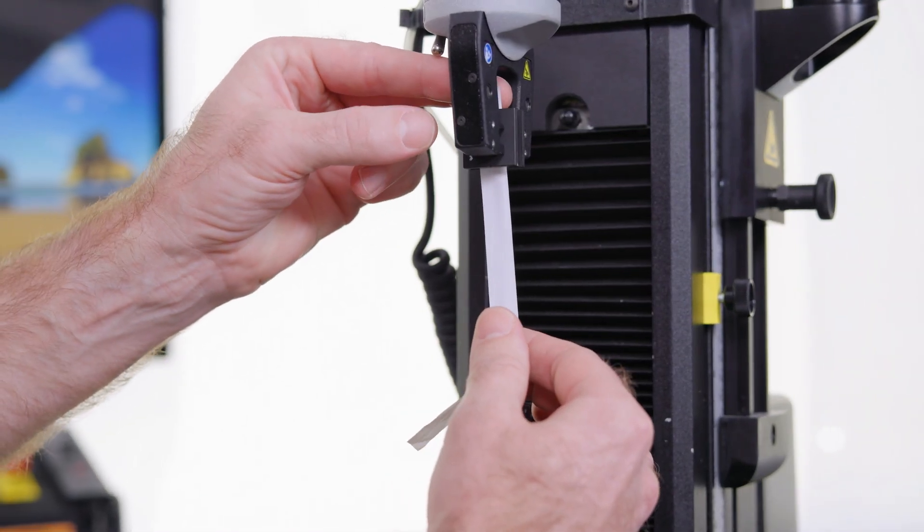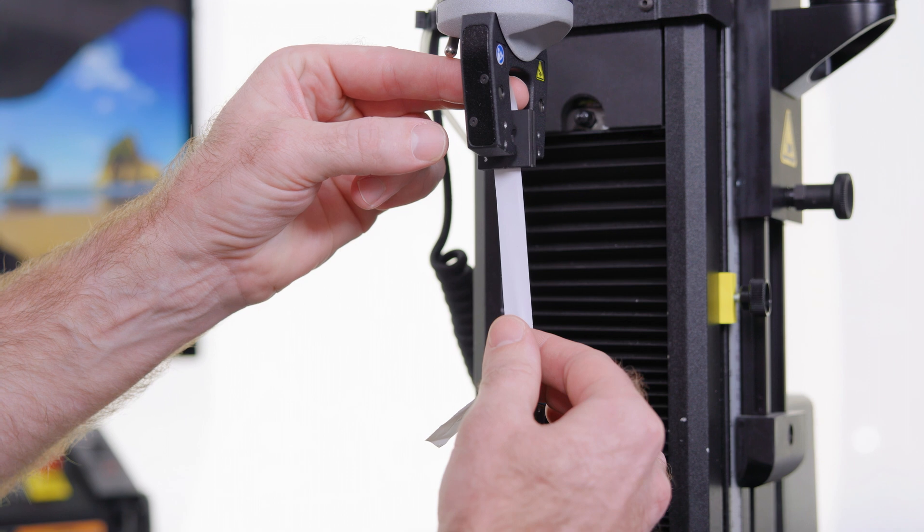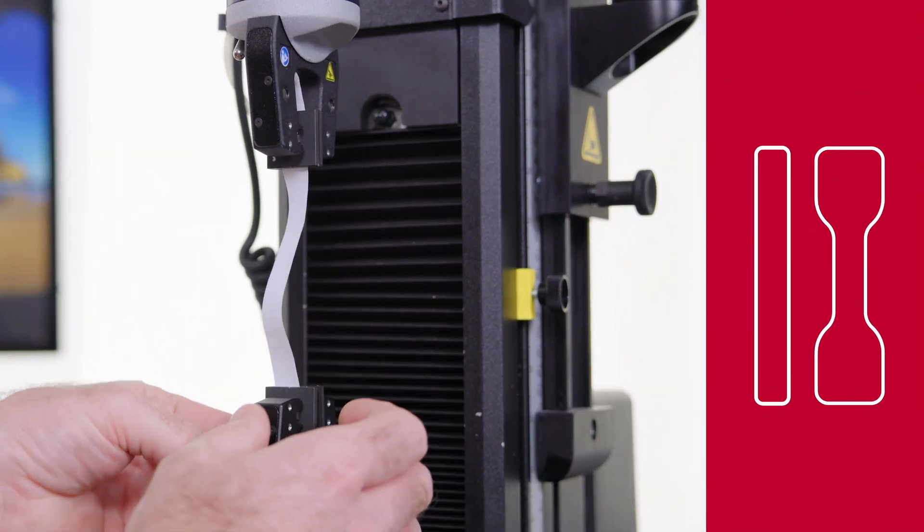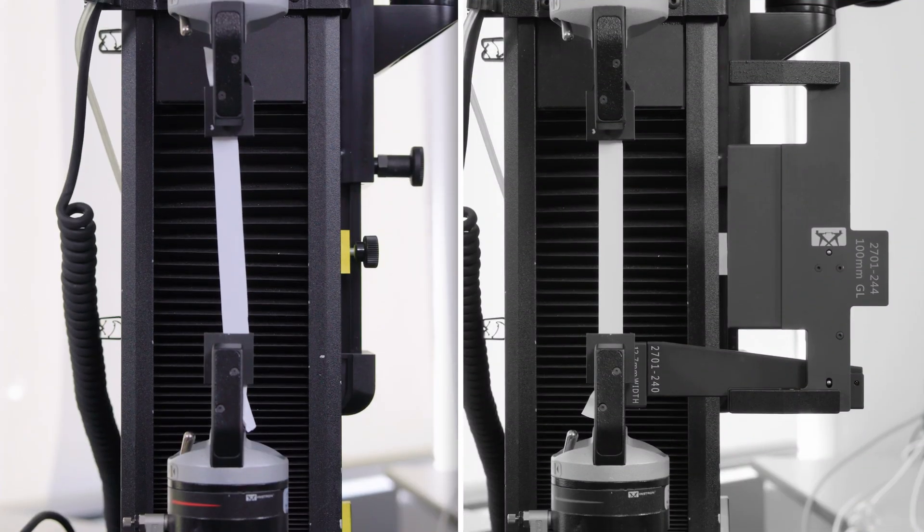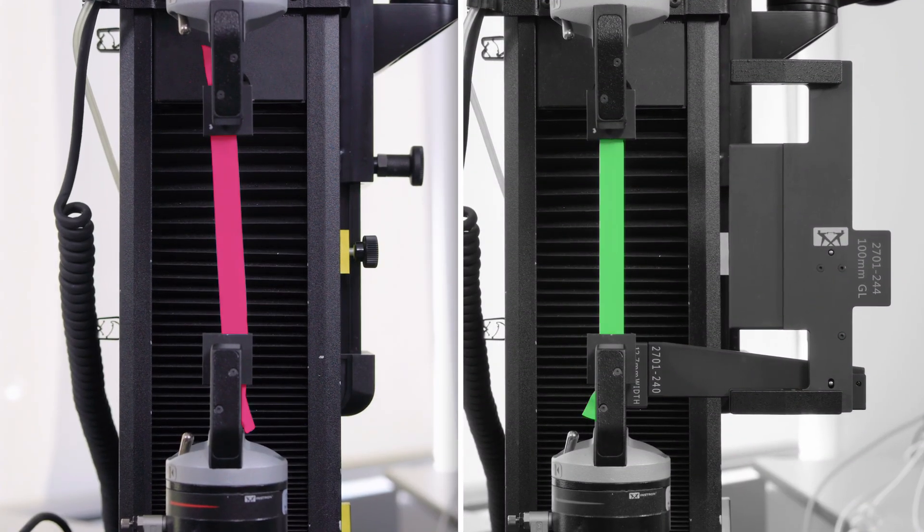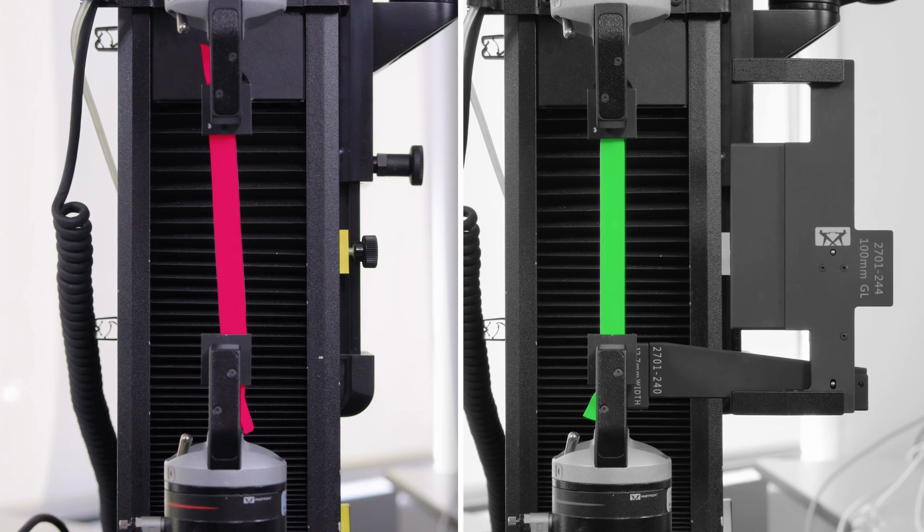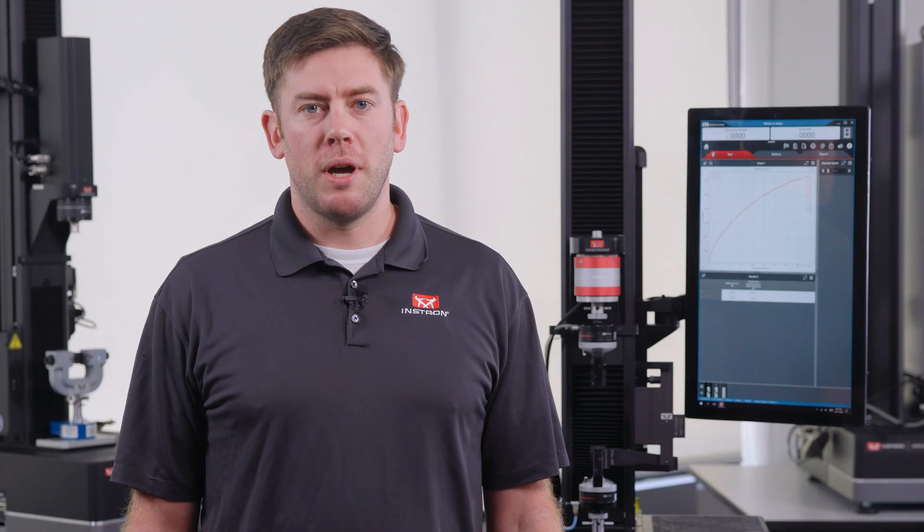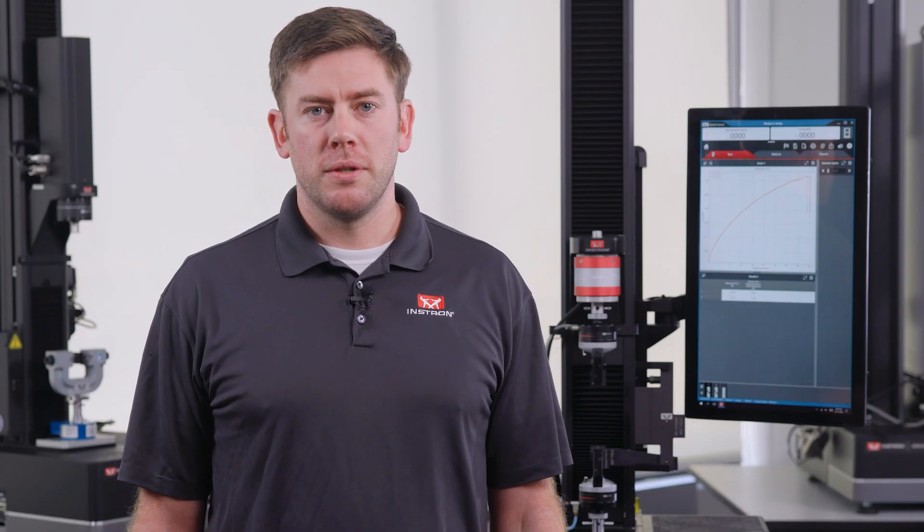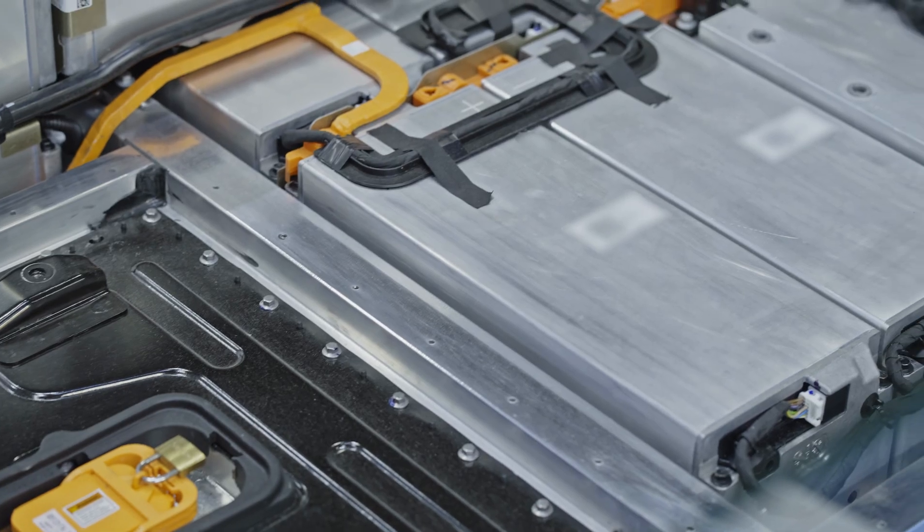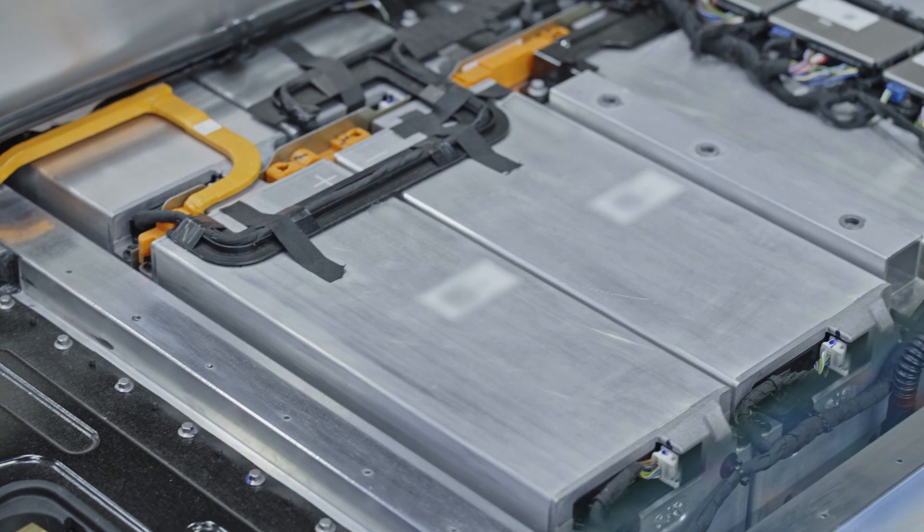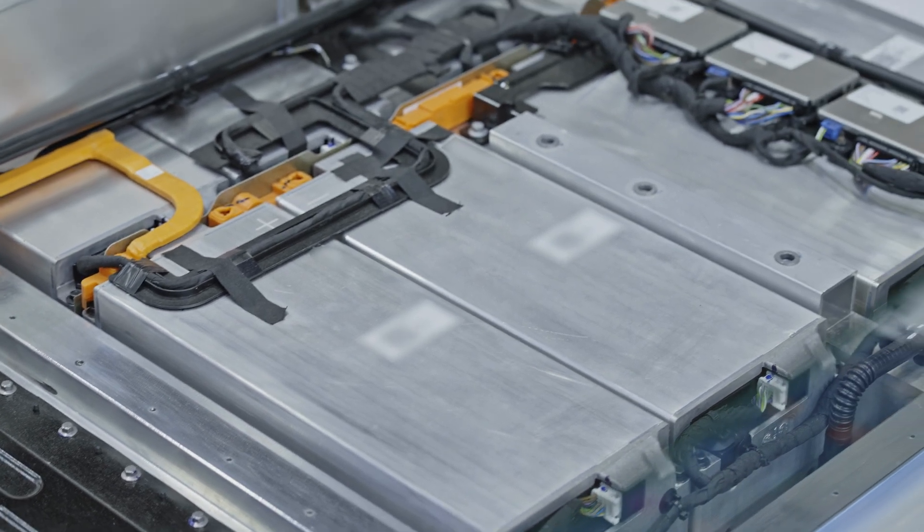They're easy to damage, and because most of the specimens tend to be rectangular shaped instead of dog bone, alignment is especially critical to ensure consistent results. We've heard this challenge echoed by many of our customers, especially with thin films and foils playing an important role in battery applications.